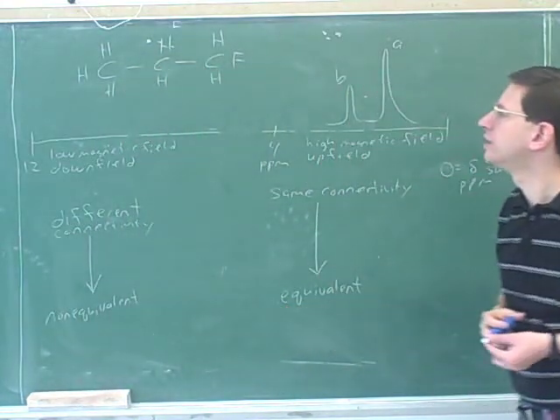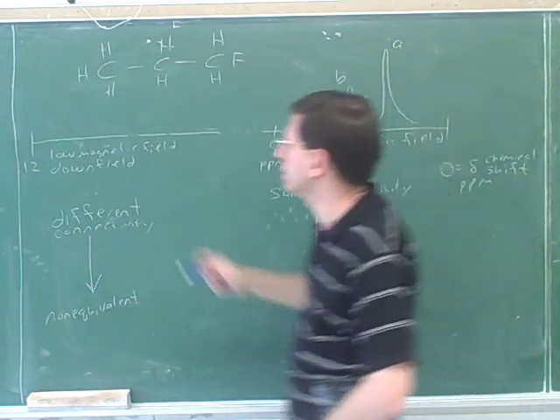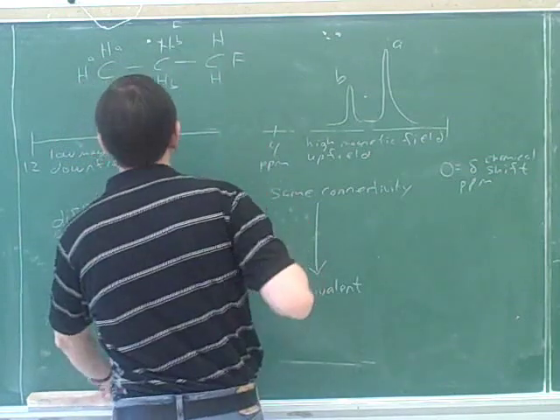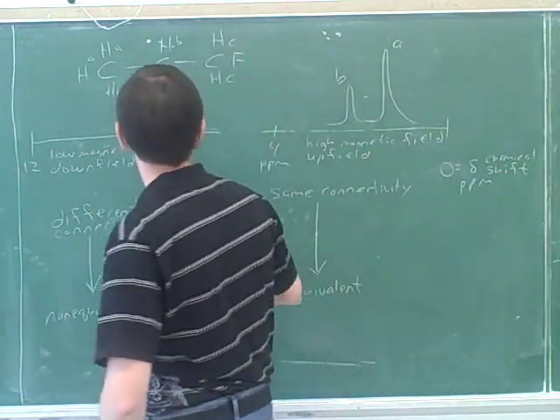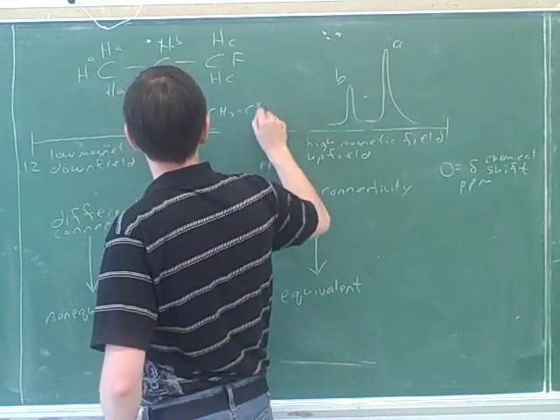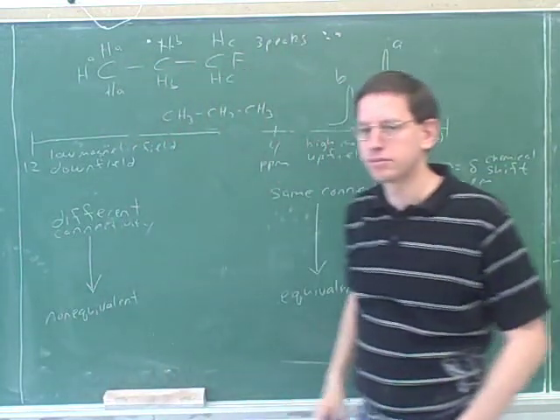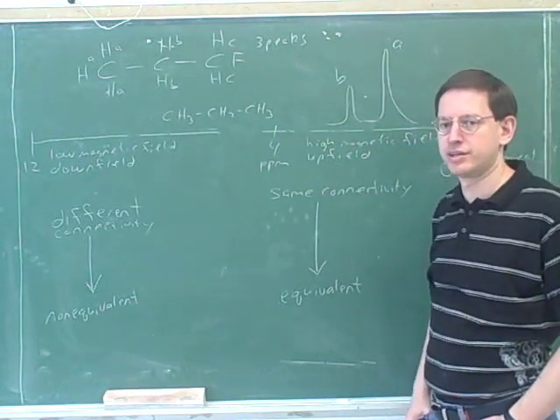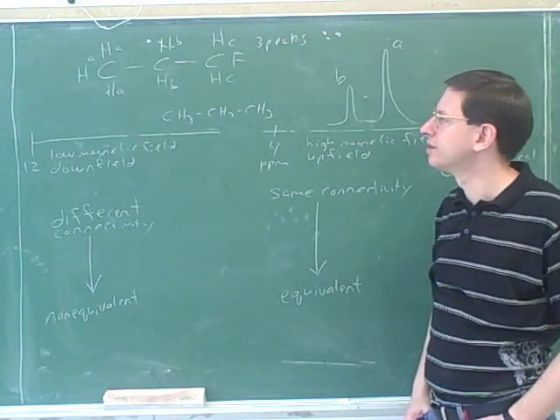How many peaks here? 3. Good. How many peaks here? Is that CH3, CH2, CH3? Right. Those are the peaks.